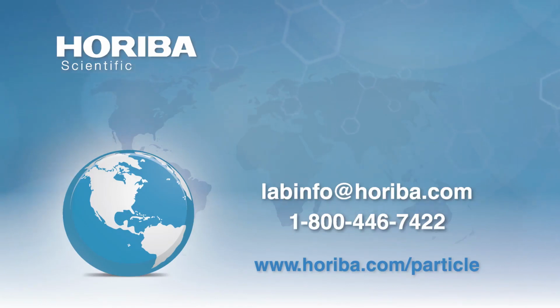Actually, there are two that are related, so I'm going to mention them together. The first is, should I use a dispersant to measure sand? And the second is when to use dry analysis versus wet analysis for a powder. They're related because if you take sand from the beach, and I'm not sure about other formations of sand, there's a fair amount of organic matter, and that makes it sticky. A lot of people will wash the sand before analysis. Most of what I've seen people do is wash the sand, dry it, and then analyze dry. So that kind of answers dry versus wet.